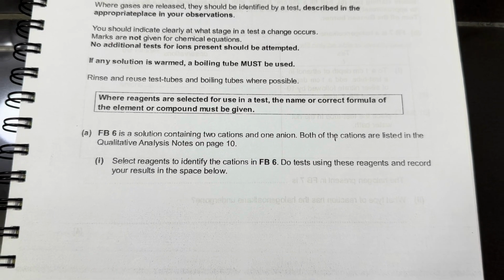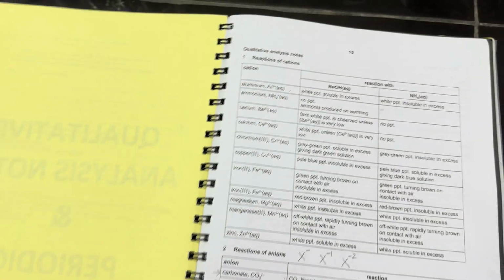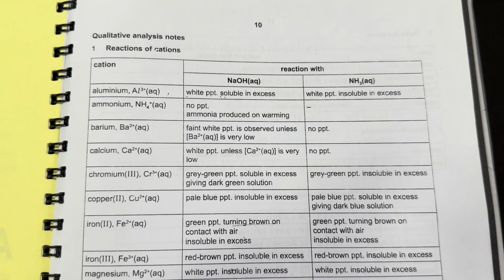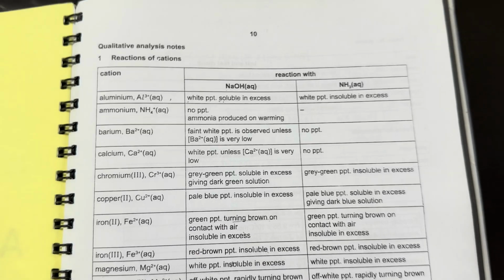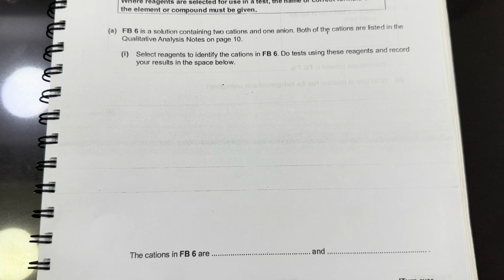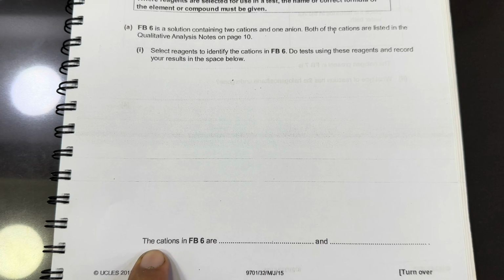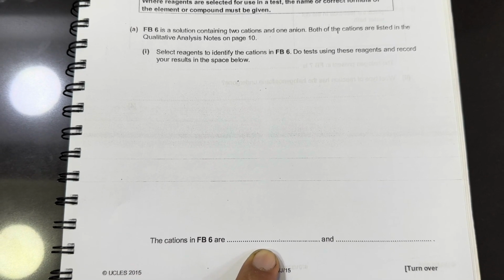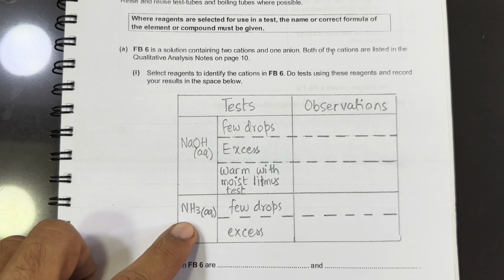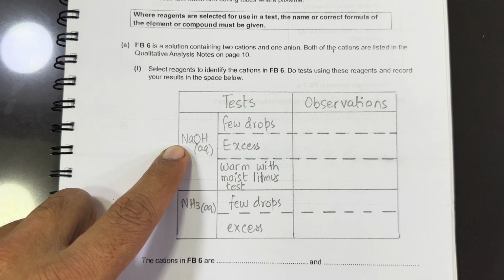Now, if we have to test cations, we have been provided with two reagents, which are sodium hydroxide and aqueous ammonia. These are the two chemicals we use to test cations. Therefore, we will make a proper table here where we will add these two reagents along with the observations we will record, and then we will find out which cations are present in this FB6. So these two reagents, sodium hydroxide and ammonia, are used to detect the presence of cations, where sodium hydroxide is used in these three steps.